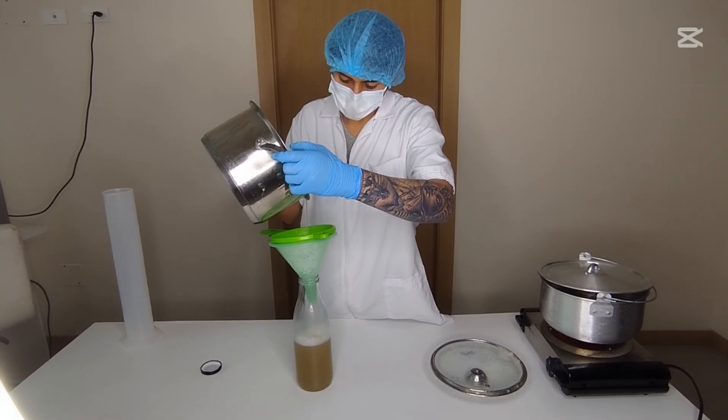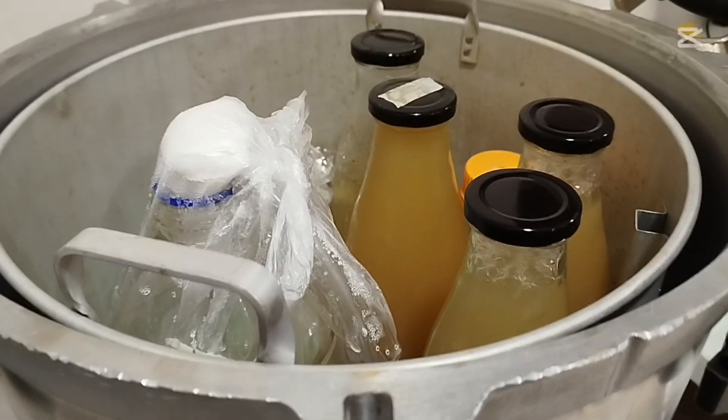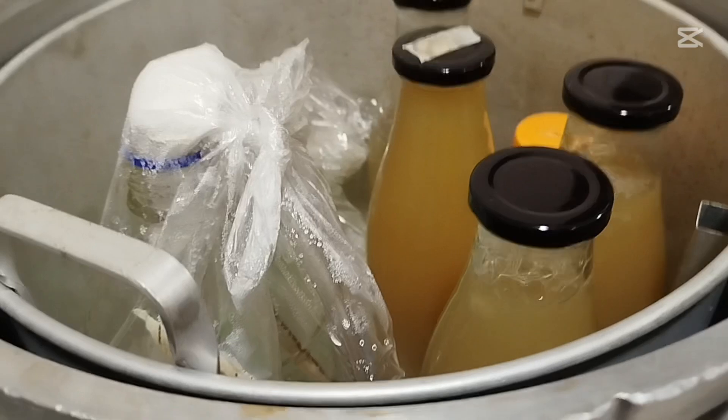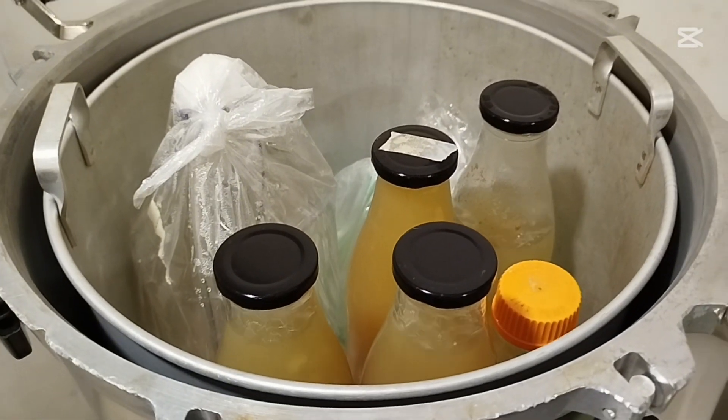Basic assembly — prepare the container: sterilize it by boiling water or using alcohol. Then drill two small holes in the lid — one for the air inlet and one optional hole for sampling.